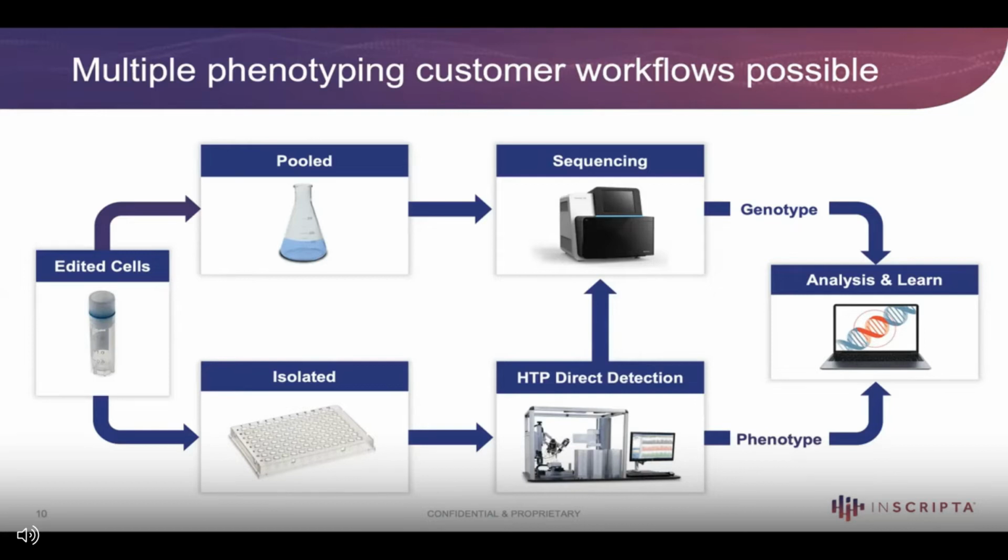And that might come through high throughput mass spec. In my case, I used a lot of plate reading, just simple fluorescence-based plate reading. At the end of the day, I get some type of phenotype readouts from that. And then that goes back to sequencing, as I mentioned, to be able to connect that genotype to the phenotype. And that's really powerful when you think through the capability of being able to generate that relationship to be able to discover new things about your organism and about the expression profile, and even the mechanism of action sometimes on how the protein is actually responding in the cell.